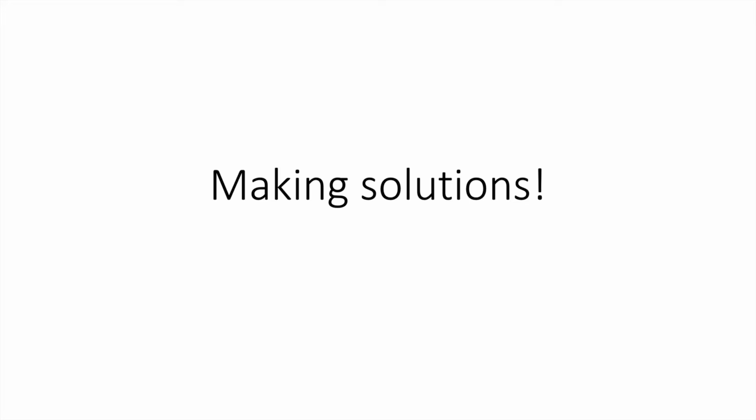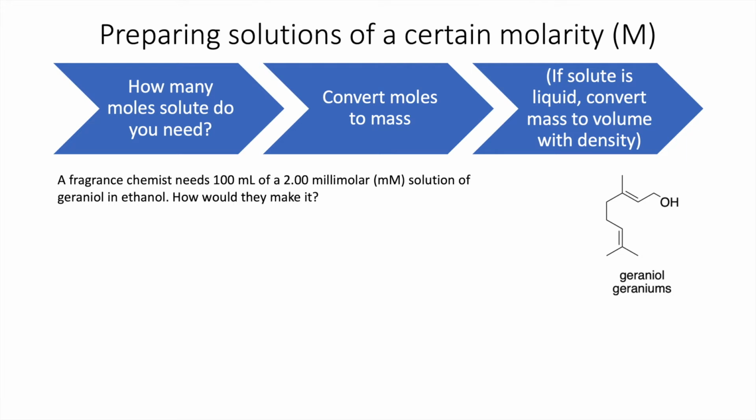Let's talk about making solutions. So chemists and scientists of all stripes have to do this constantly. And so let's just talk about practical stuff. Okay, so when I'm asked to prepare a solution of a certain molarity, I really focus on, okay, how many moles of solute am I going to need, full stop.